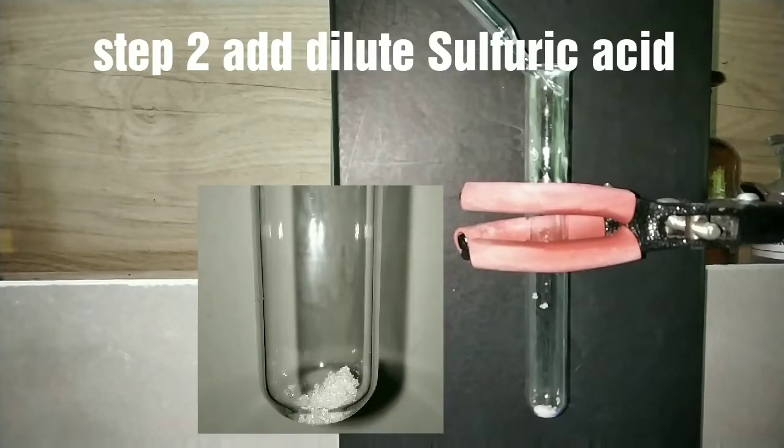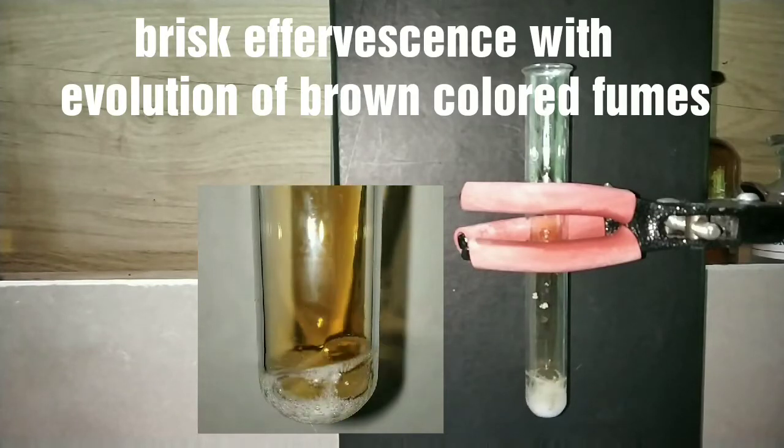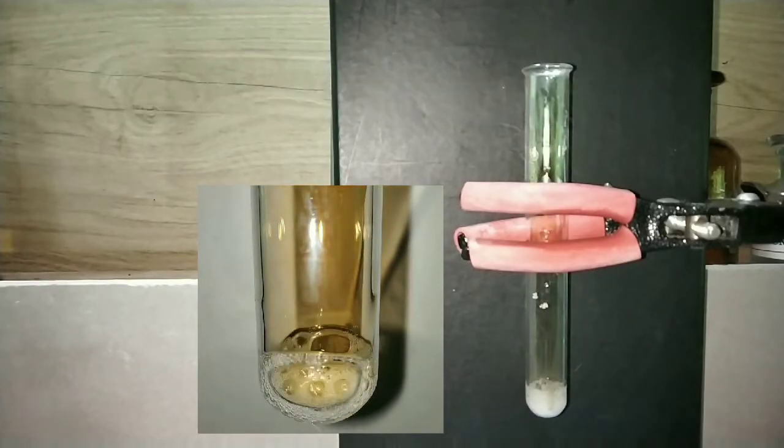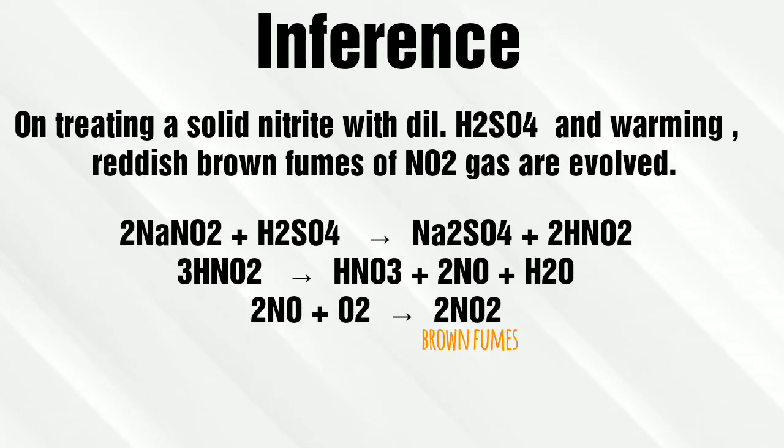You can note that as soon as I add the sulfuric acid, there is brisk effervescence with formation of brown colored gas. Inference: nitrites react with sulfuric acid to form reddish brown fumes of nitrogen dioxide.